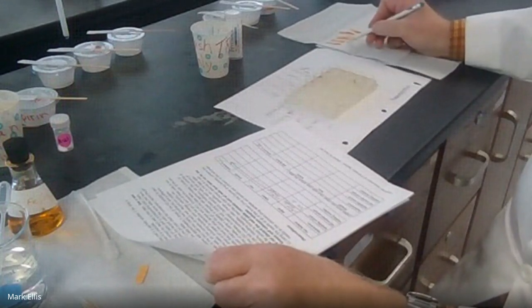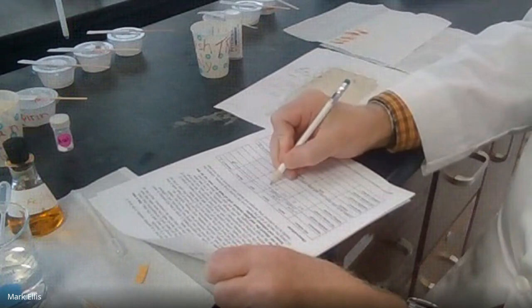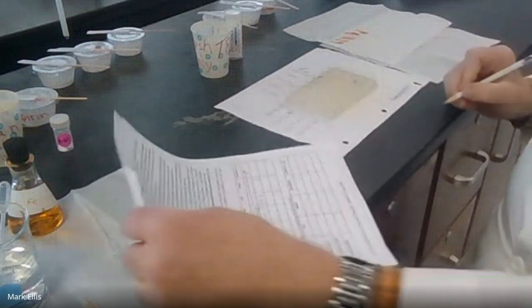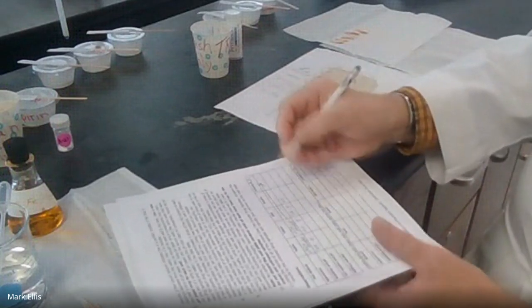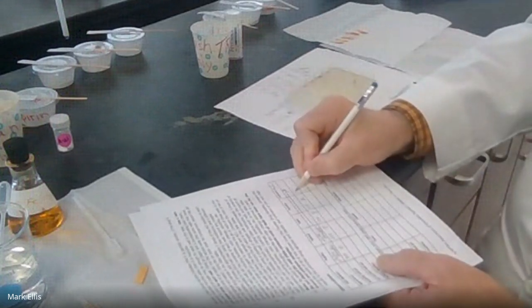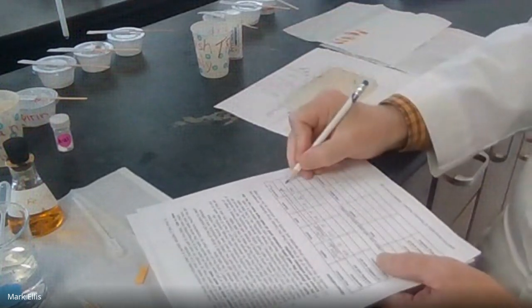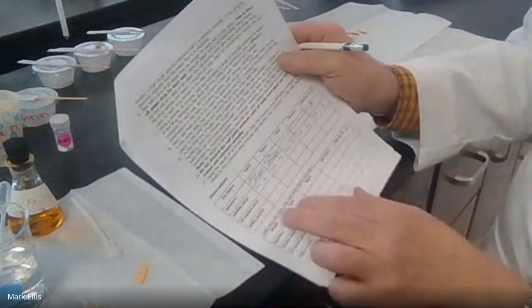Tylenol was neutral. See, I kept them in the same order over here so I can easily go back and review. So Tylenol was insoluble and neutral, so it's about 7. Same way with the Advil, it was insoluble and neutral, so it was about 7. Excedrin was insoluble and acidic, so I said it was about a 1 or a 2, so let's say 2. And my unknown was insoluble and about a 1 or 2, so let's say a 2. You don't have to argue over the 1s or the 2s. If we needed pH that precisely, we would use a pH meter or titration.